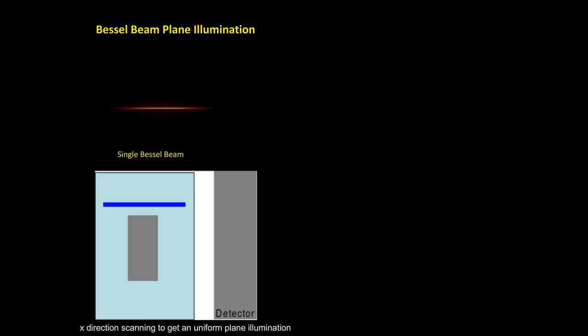For the actual resolutions, we can do the scanning. You will see the optical scanning is synchronized with the objective scan. You will see the excitation laser, and the objective here is at the focal plane of the excitation laser beam. By synchronizing these two, we can see the 3D scanning. This is what we call the objective scan.